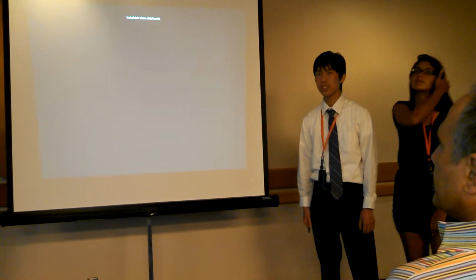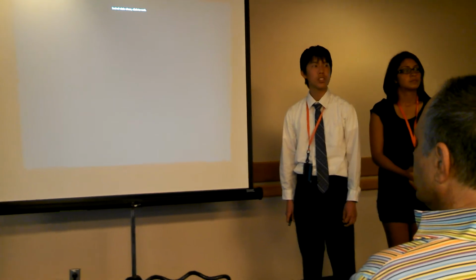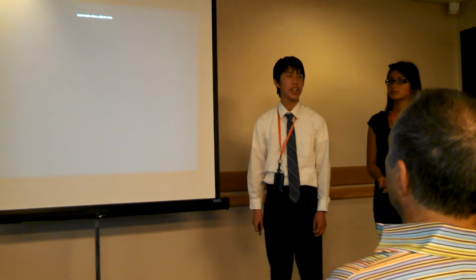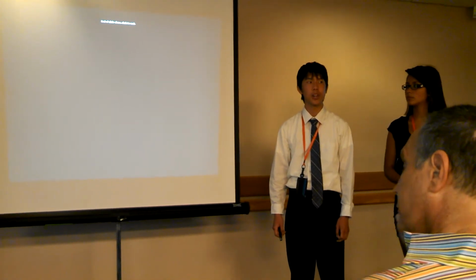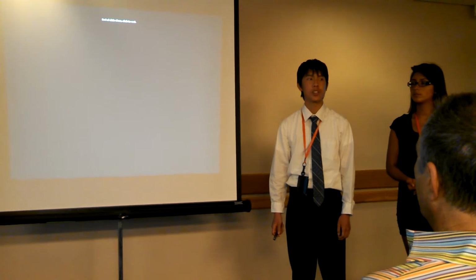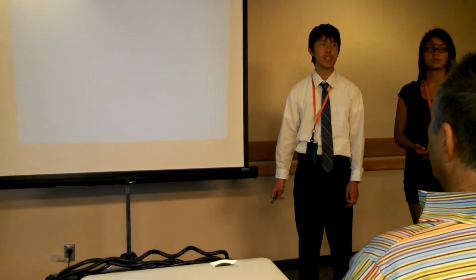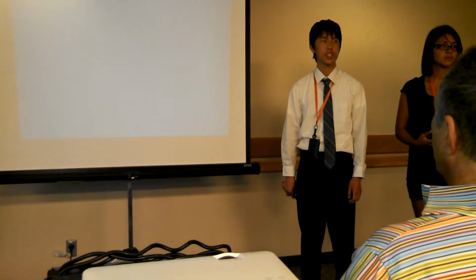Are there any questions? Can you use this technique to detect whether water is safe to drink, whether it's contaminated or not? Yeah, so you could determine the spectrum of normal deionized water and compare it to what you want to test. And then if those don't line up, you know something is in the water that you're testing.